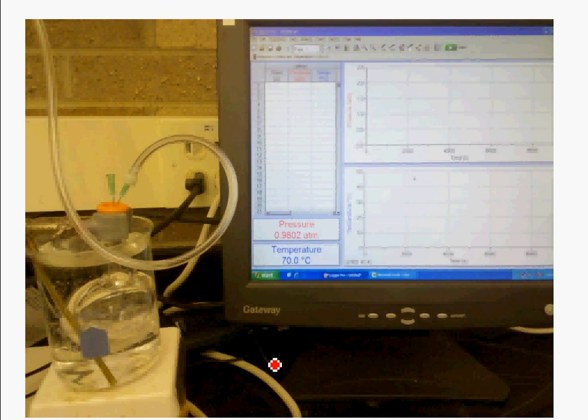Let me talk about all the pieces that are here. In this flask, I have a sealed flask that has a septum sealed, just like we've done in previous experiments. In this flask is mostly air and a small amount of water, maybe 2 milliliters of distilled water. And we're taking that whole sealed flask and putting it into a hot water bath.